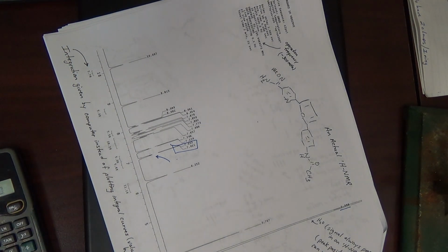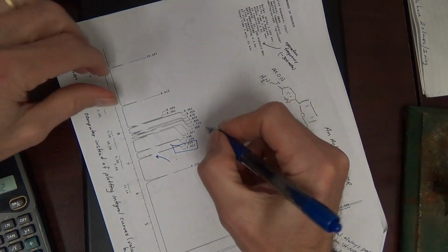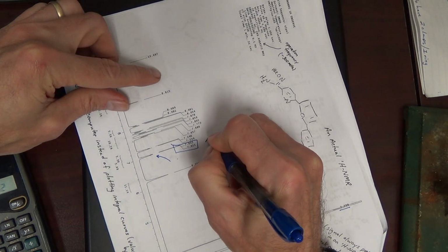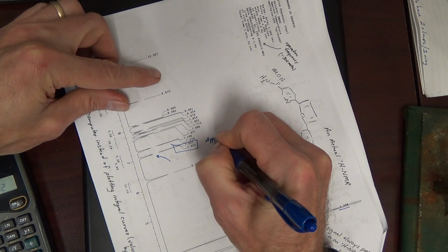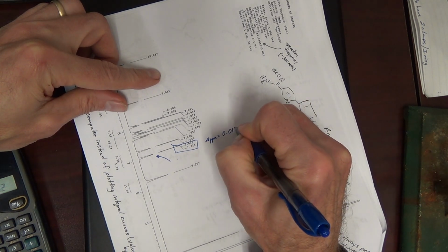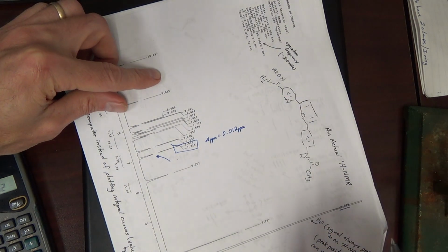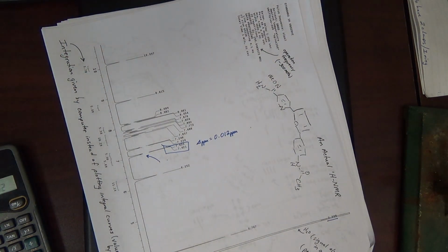And so that is 7.033 ppm minus 7.021 ppm equals the difference in ppm, 0.012 ppm. That's the width of the doublet.